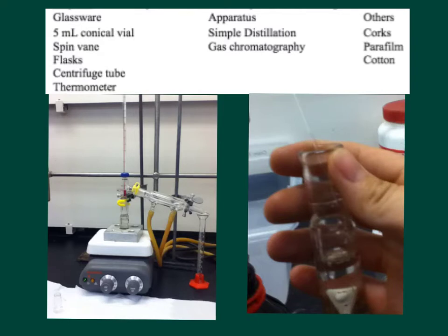Also, let's look at the equipment and apparatus we're going to be using in the experiment. We're going to be using the 5 mL conical vial with the spin vane, and we're going to be using a centrifuge tube as a receiver when we set up our simple distillation apparatus. Here we have our water-jacketed condenser, thermometer, our vial, and it's going to be placed over a hot plate.